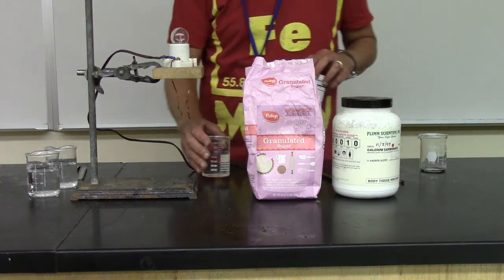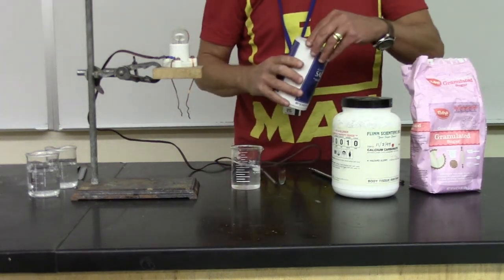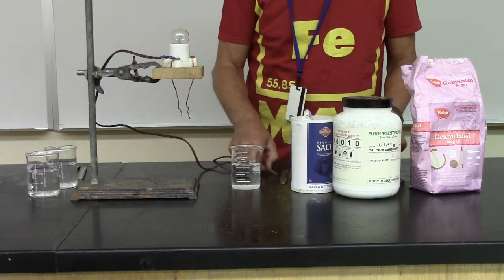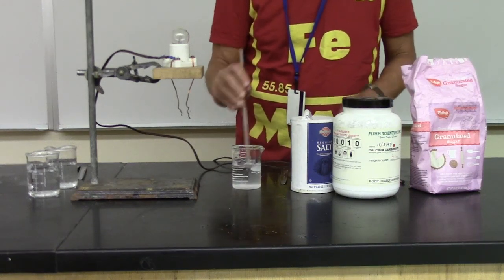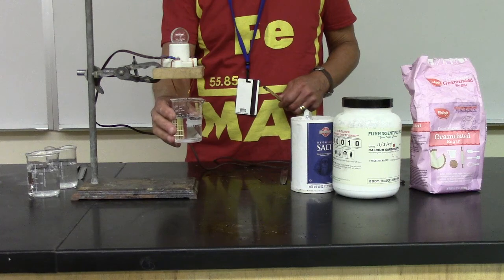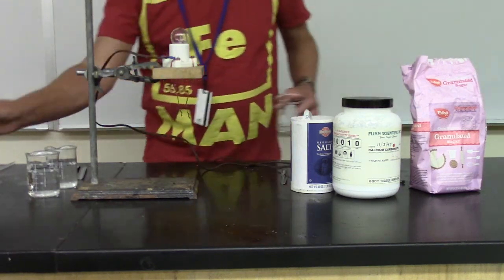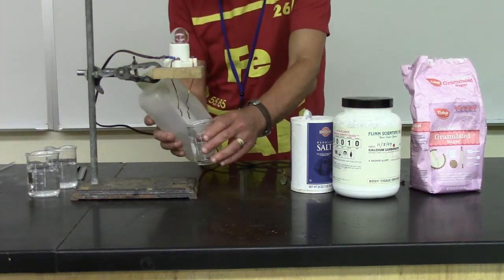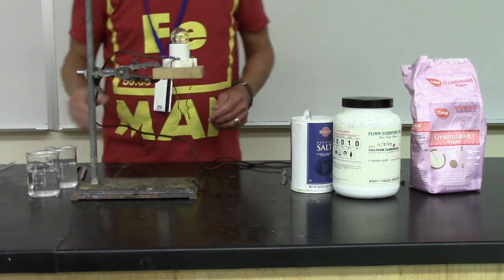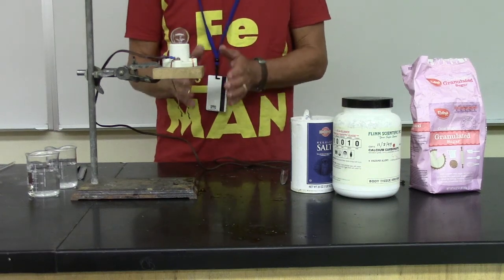But let's take something else, a very common material. Table salt, better known as sodium chloride. Let's just put a little bit in there, and give it a stir. And let's test to see if it lights up. Look at that. The light bulb lights up very, very brightly. We're going to rinse this so you can see that what we call sodium chloride would be called a strong electrolyte, because a solution of it, when it dissolved, conducted electricity very strongly.